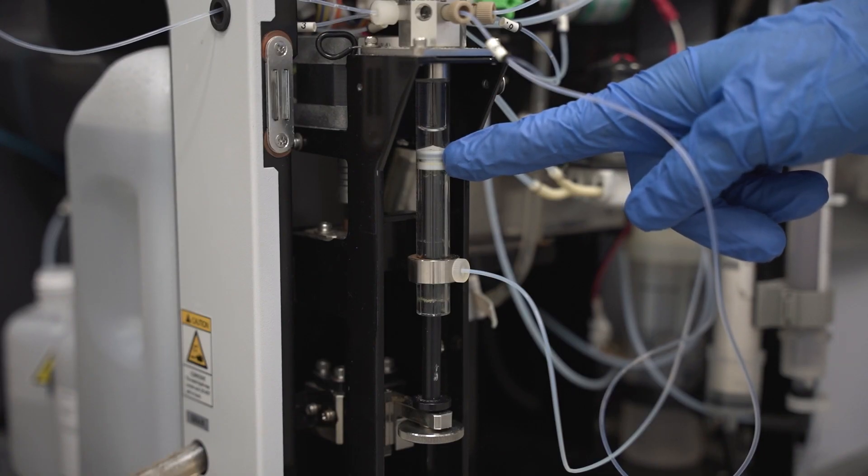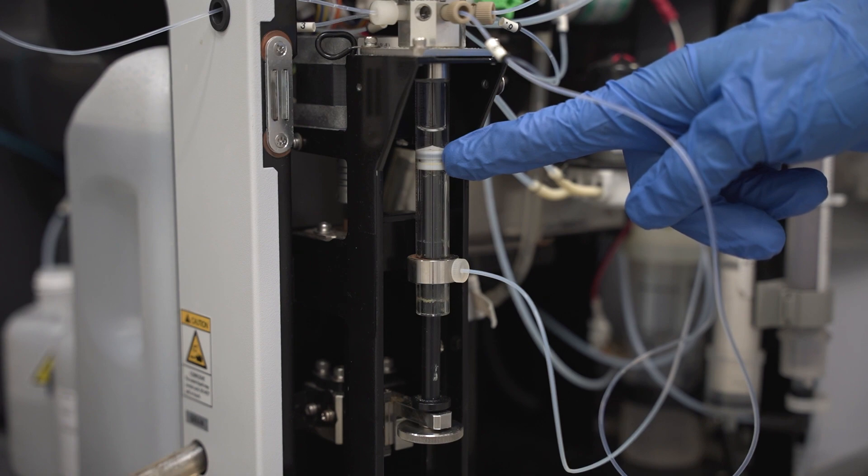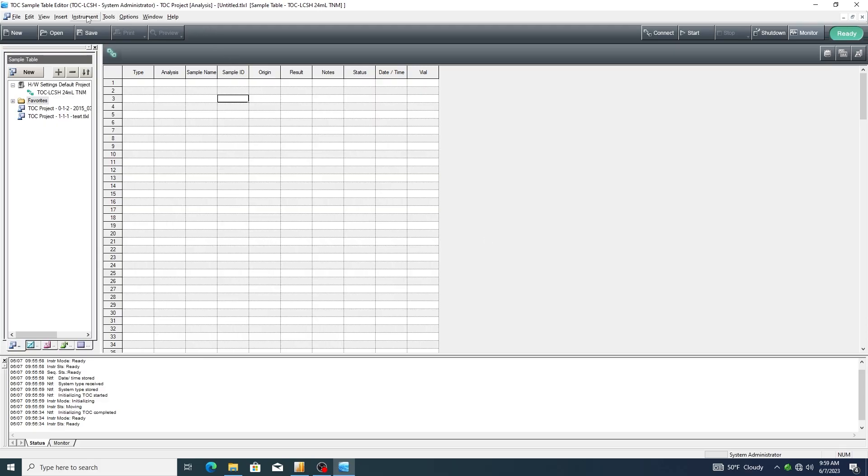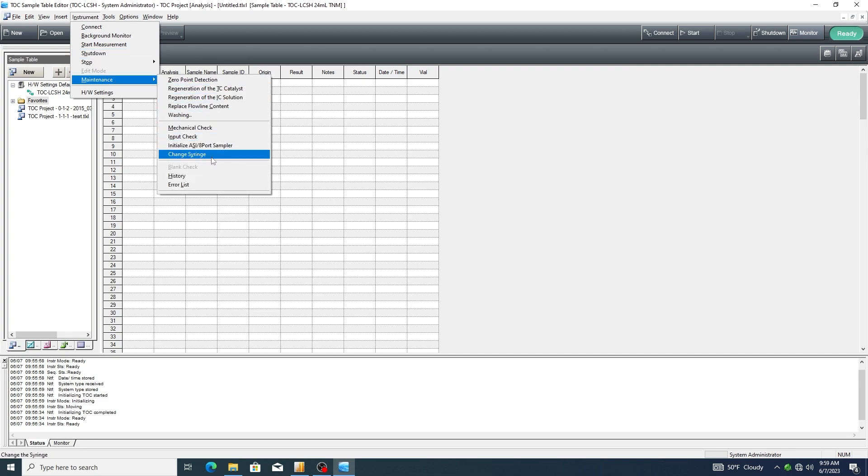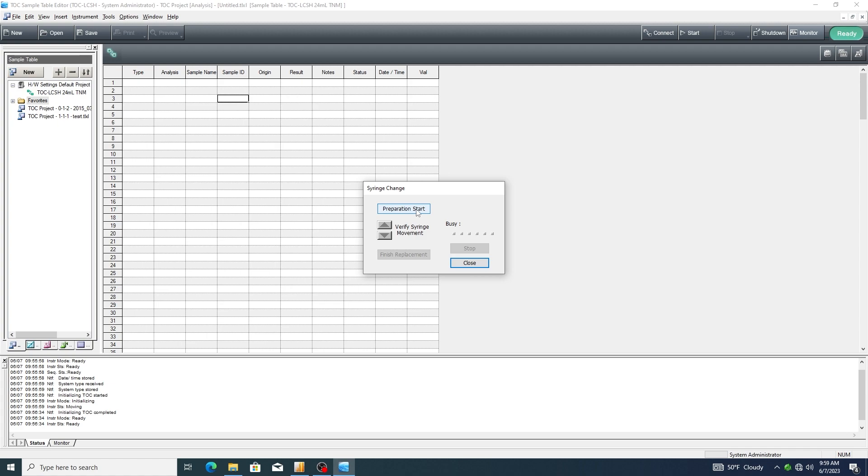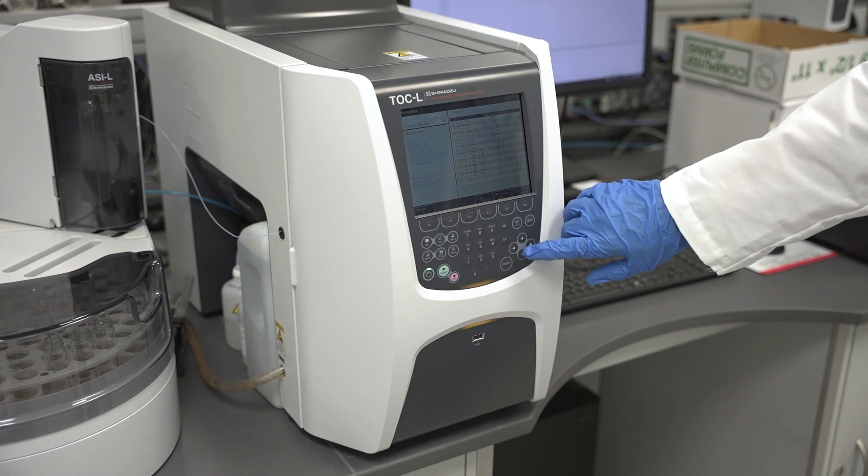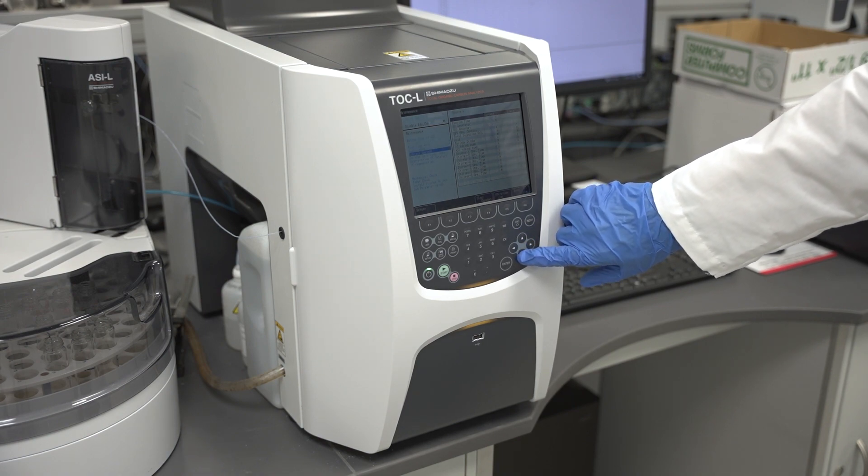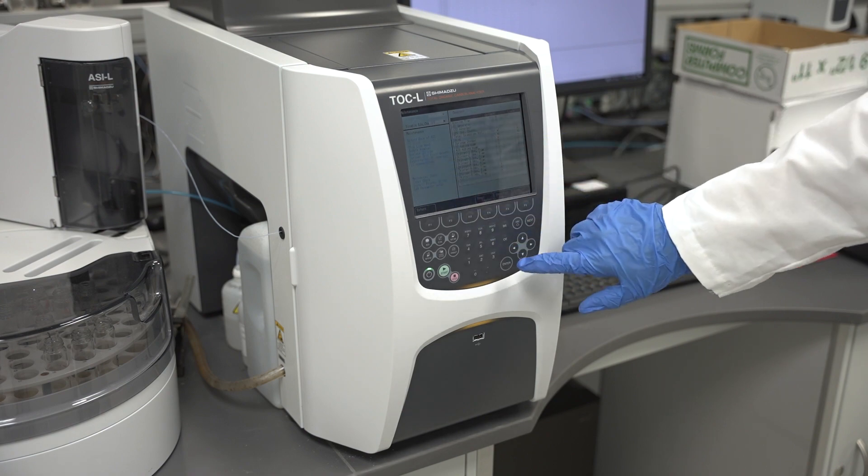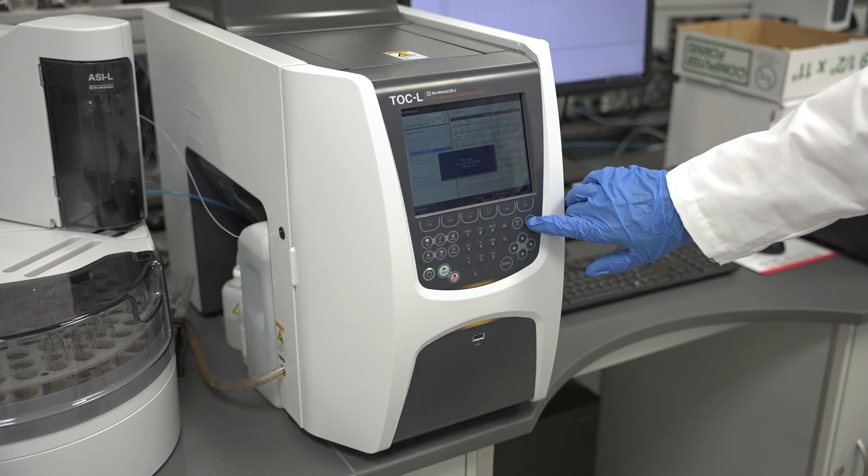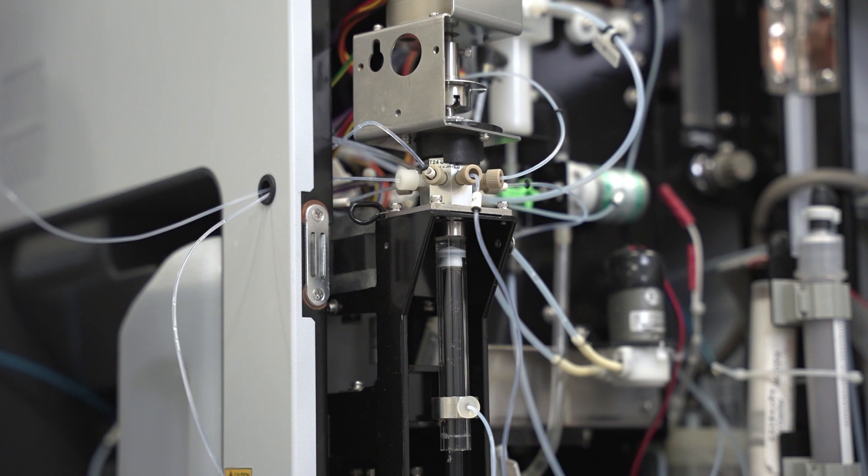Now we will move on to replacing the plunger tip in the syringe. First, go to the maintenance screen and to the option for change syringe. For PC-controlled instruments, this can be found under instrument maintenance replace syringe. Press preparation start in the next window. For standalone instruments, push F5 for maintenance on the initial screen. Then use the down arrow key to highlight replace syringe and push next. The instrument will now prepare the syringe for replacement and move the plunger down.